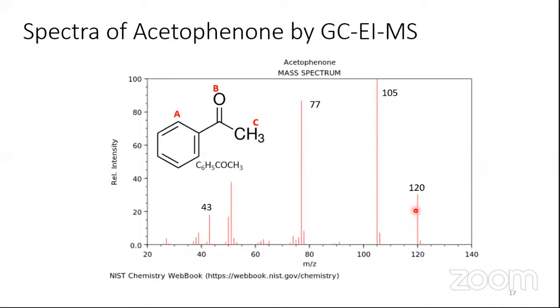If you find that any of the slides is not very clear to you, let me know, so you do not miss anything. Okay, fine. So this is the molecular mass of this molecule, and we know it is 120. Of course, I know this molecule because I have injected it, but even if I didn't know, I could see that this is the molecular weight of this compound.